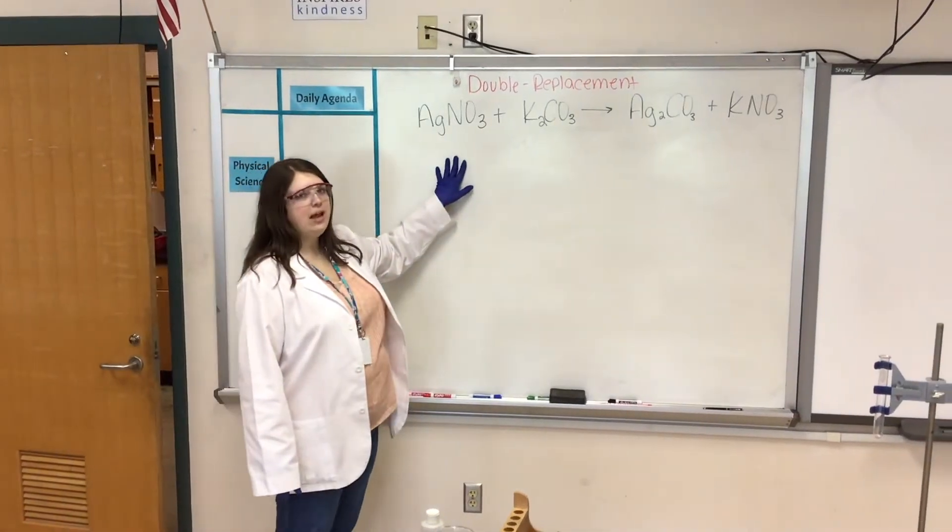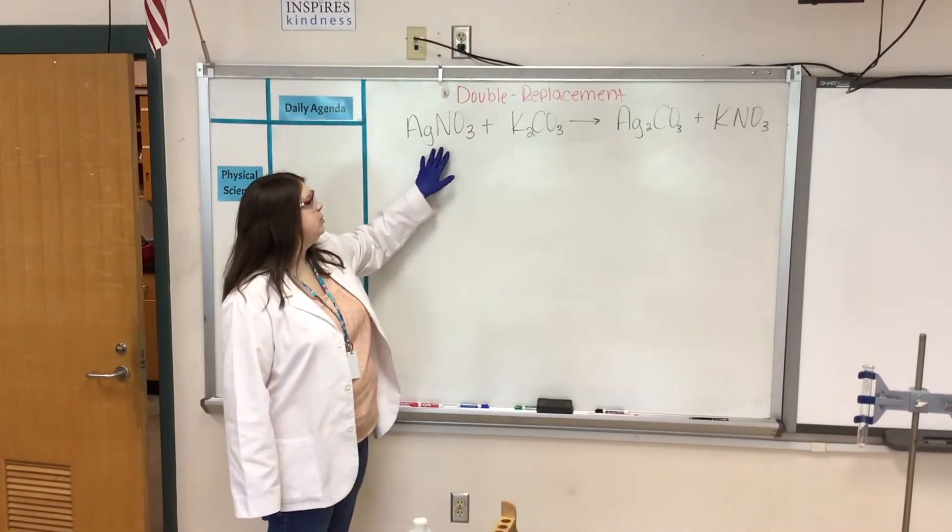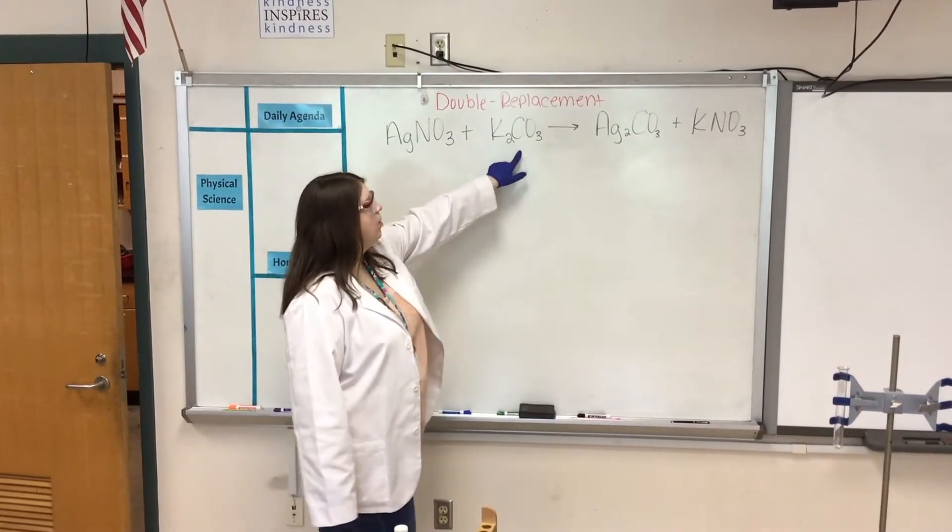Now, we're going to observe a double replacement reaction between silver nitrate and potassium carbonate.